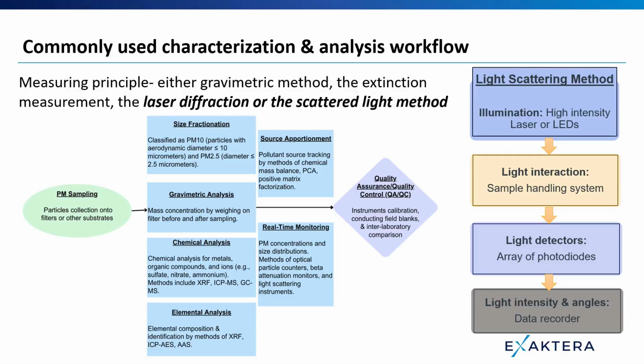But it's only when we introduce optical particle counters and light scattering instruments that we can achieve practical and cost-effective real-time monitoring of industrial processes or environmental conditions. The schematic on the right is for a typical laser diffraction optical system and includes a light source, which might be a red, infrared or blue-violet laser, a sample handling system, an array of photodetectors, and data recording equipment.